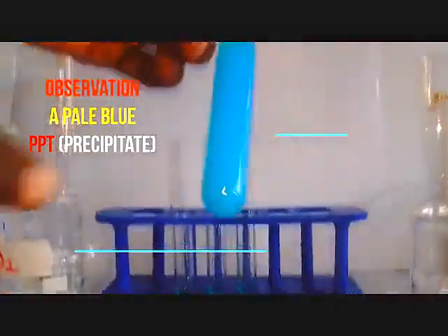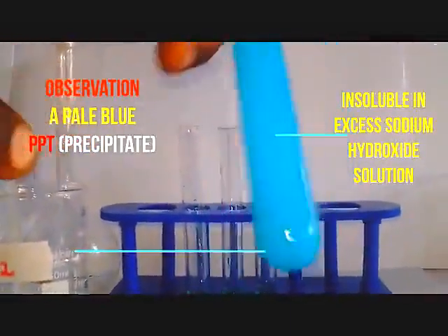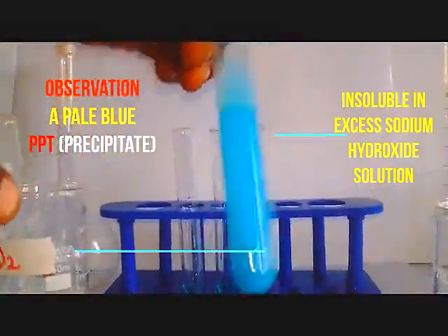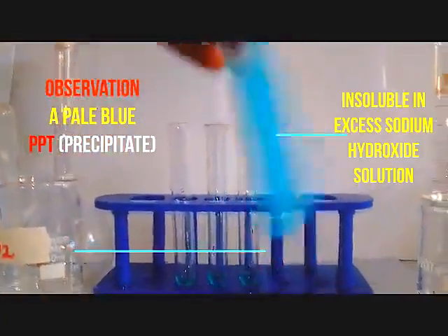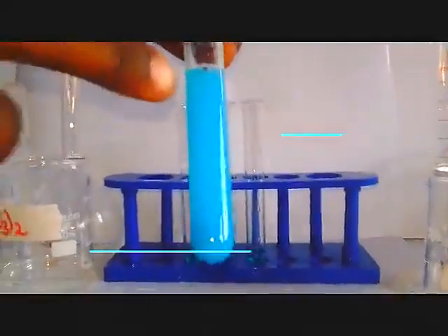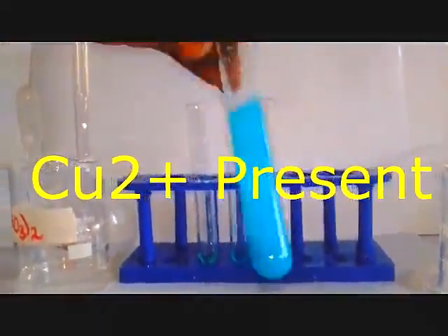So here the observation is a pale blue PPT insoluble in excess sodium hydroxide, and in this case we are suspecting copper 2 ions. We are eliminating iron 2 ion because iron forms a green PPT, so it cannot form a blue PPT. So we are only remaining with copper.